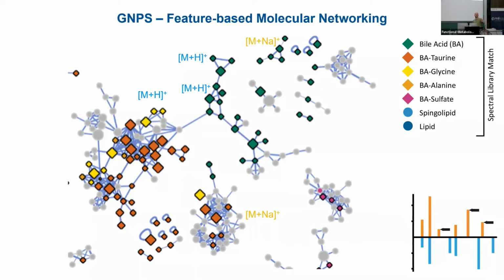So, do you want to go ahead? By the way, the question for yesterday might be a short one. I understood yesterday that NTMSS is taking the peak area, not the peak height, which sometimes is called peak intensity. Is it also possible to pick peak height in NTMSS?